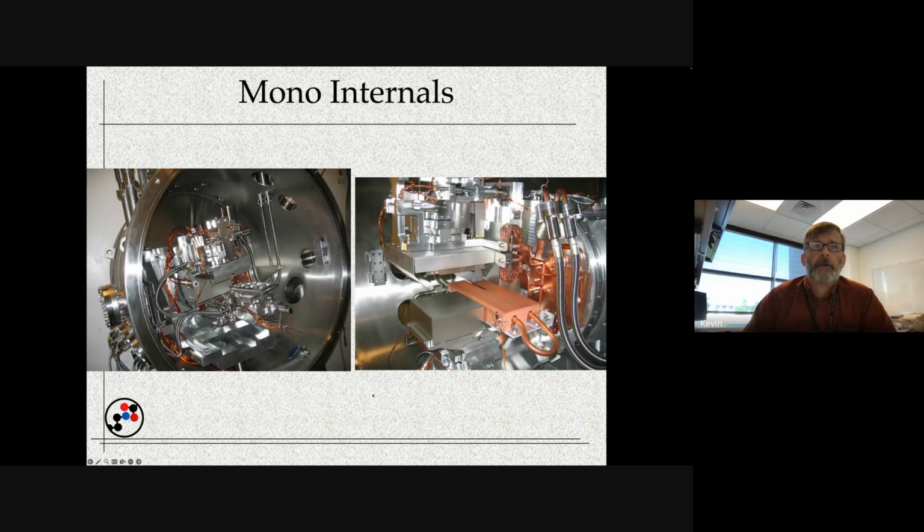So the inside of one of these looks something like this. The X-rays are coming in from the right-hand side through this port, and they're going to exit the left-hand side through this port. The picture on the left doesn't have the crystals in it, but the picture on the right does. You're looking downstream, in the direction that the X-rays are going to come in.